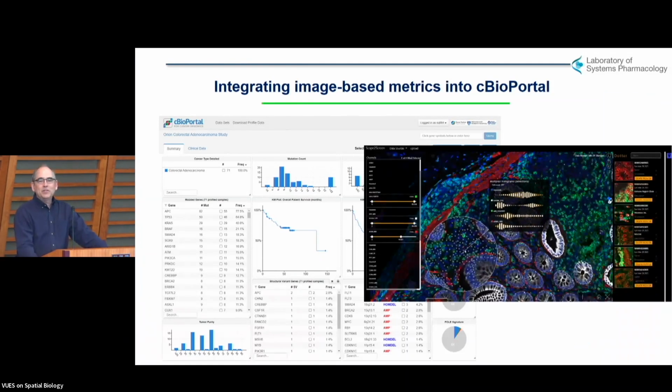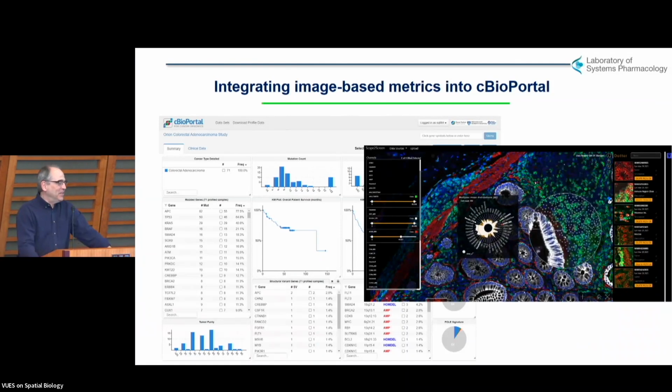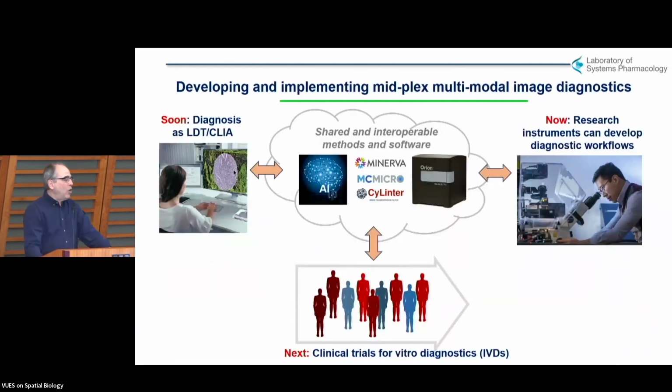And I think this is Robert's image that I shoved in there, showing that you can't get this in cBioportal, but you can get something simpler to that. So you can actually begin to get some spatial data. And I would recommend that to this community as an alternative interface to something like the Cell Atlas interfaces, which are based on the human body and morphology.